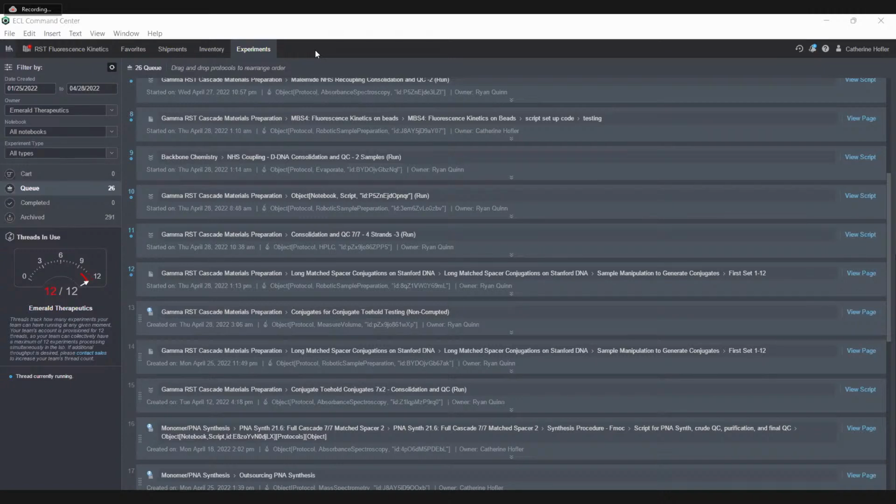It's a composition of a lot of those machines too. Even that NMR, it's not using paper tape anymore, but there's a big 500 by Bruker, probably even the same manufacturer, and that instrument isn't so terrible. It has something close to an API we can talk to. But it's all the sample prep, and then there's 200 plus instruments networked together in this environment. We're trying to make a whole laboratory at the end of the day, which is the exciting part. And then everybody can be remote and doesn't ever have to set foot in it.